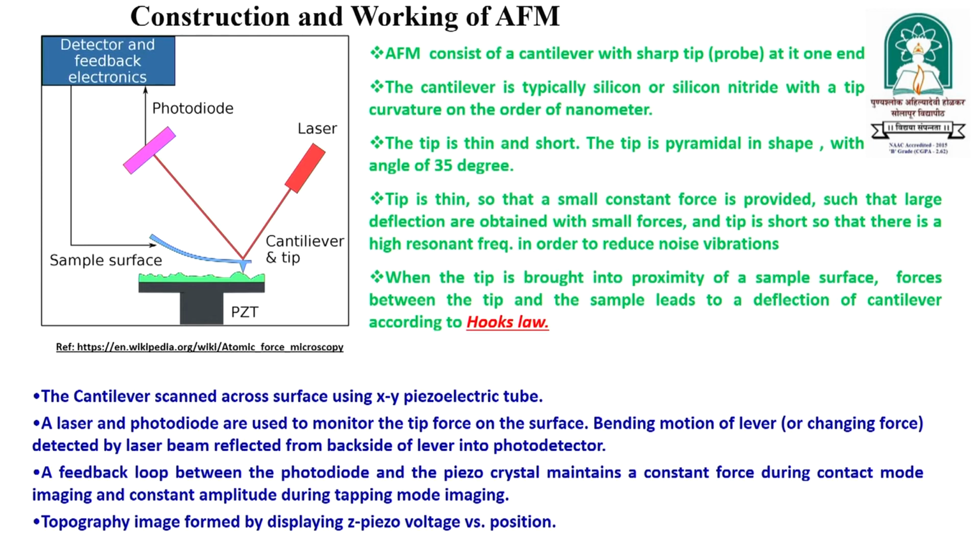There is a feedback loop system between the photodiode and the piezo crystal that maintains a constant force during the contact mode operation of AFM imaging, and maintains a constant amplitude during the tapping mode imaging process. The topography images are formed in AFM techniques by displaying Z piezo voltage versus position.